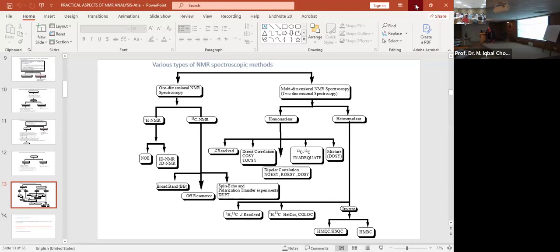I remember one year ago, at a conference, maybe from Canada, we should ask for a mixture. I asked him how we can do it for 10 days. You can definitely record whatever you want to record, whatever is soluble, put it in an NMR tube and you can record it. Definitely no problem. The problem is analysis. Recording is no problem. Even if the whole plant mixture is thousands of compounds, you can record it. How you would analyze it is the question.